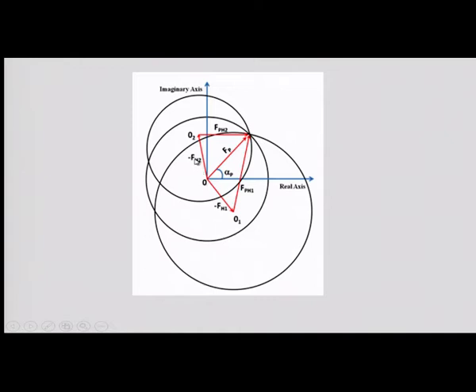Then for the second derivative, going this way, the origin O is shifted to O2. Now minus F_H2 added to F_P gives F_PH2. So with O2 as the origin of the third circle and with radius mod F_PH2, I draw this circle: three circles.